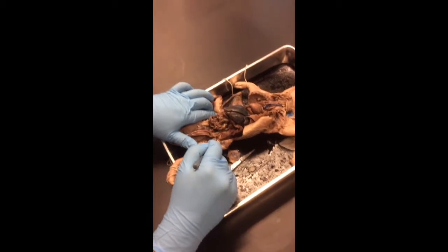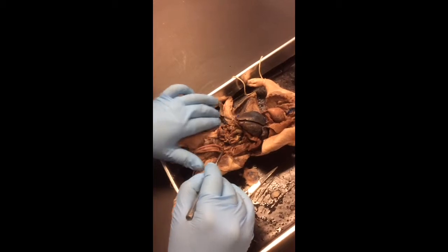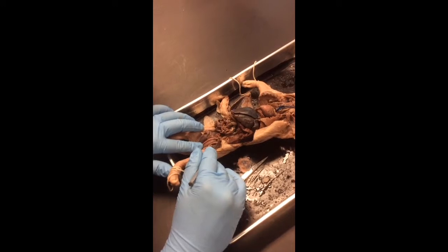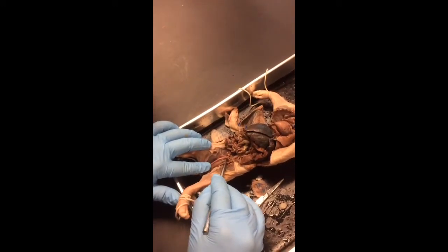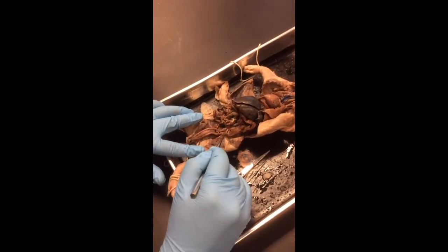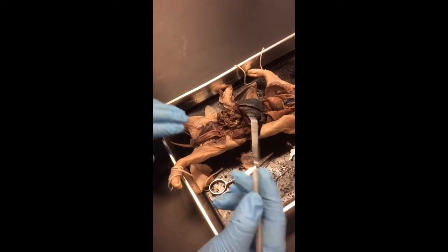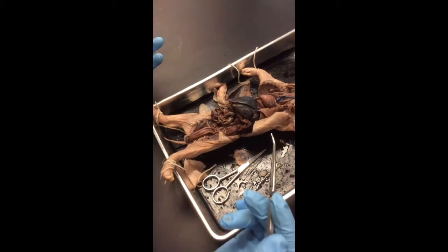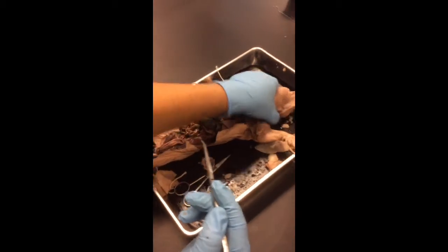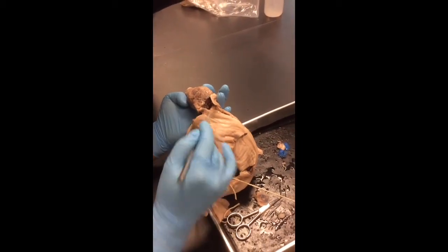Reproductive organs, we got ovary, to the fallopian tubes or the oviduct in the pig, to the uterus or the horns of the uterus first, and the uterus itself, which is really tiny and hard to see. It's right here, it's the uterus itself. Like I said, for male-female sex organs, we tend to pin the ovary for females, testes for the male, and ask you to identify the sex. I don't have a male, so I can't really explain that stuff. But look for the testes in the males. And then the last part is the brain. Cerebral cortex in the front, cerebellum in the back, and those are the two parts we tend to pin.